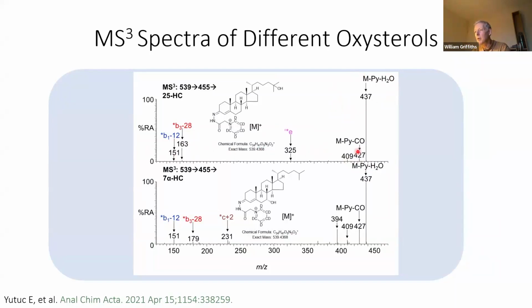Everything else is small. And if we put the hydroxy in the ring system, we get a completely different fragmentation pattern down at the bottom end of the spectrum altogether. So this is useful. When we look at data, we can really be sure what each peak is. And if we get a new peak, we can make a pretty good stab at identifying what it is as well. So these are the advantages of the derivatization method that we use.